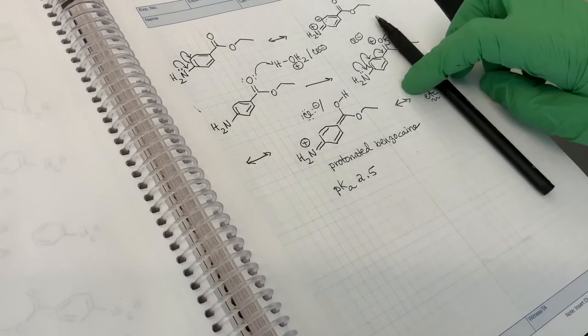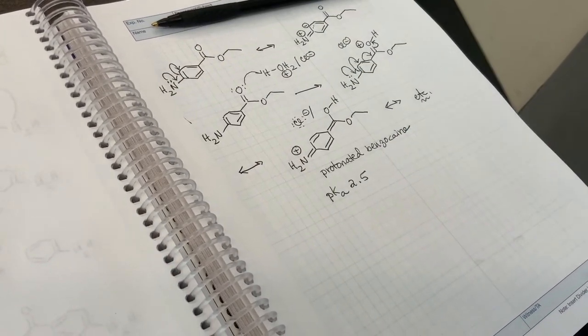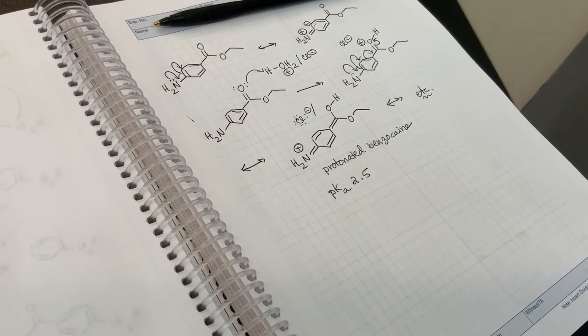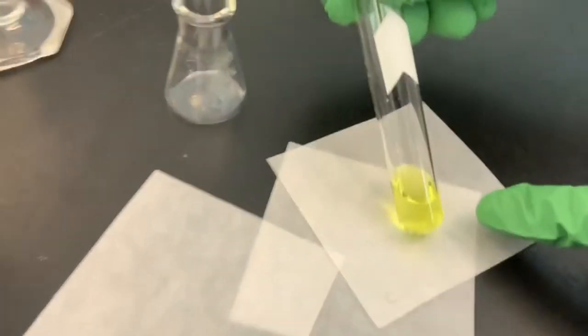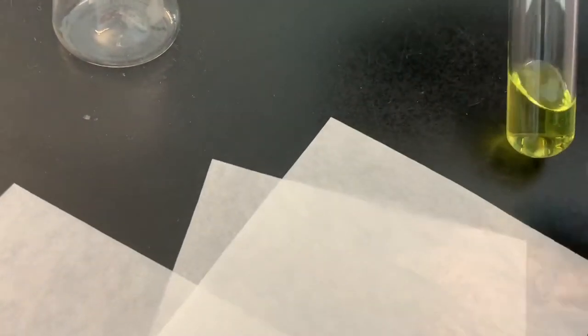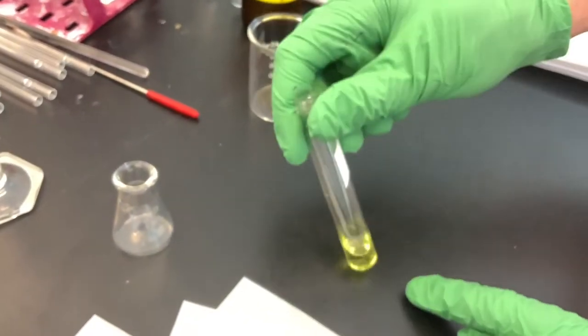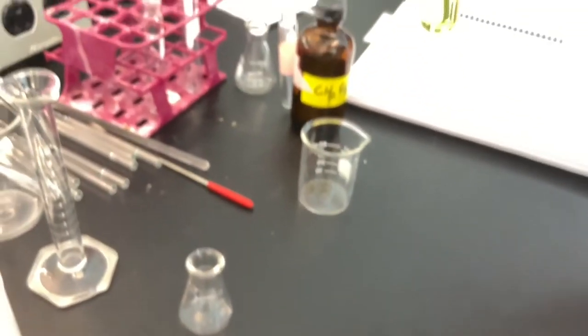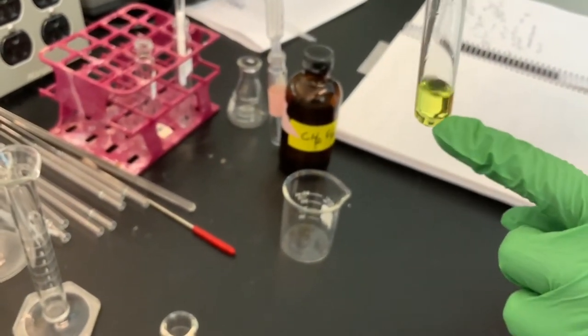All right, so hopefully that theory makes sense. Review it, because acid-base chemistry is extremely important. Now, at this point in time, after discussing the acid-base chemistry, we see that everything here is dissolved, right? So this is a clear solution now, but it's a yellow solution. And this is methylene chloride with 9-fluorenone, benzocaine, and benzoic acid.